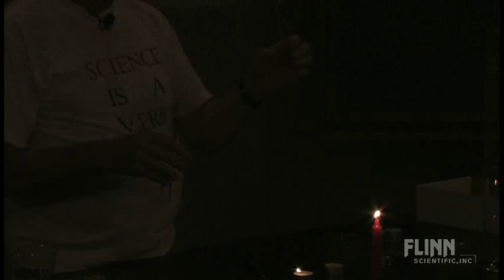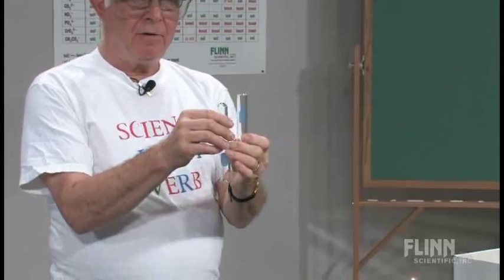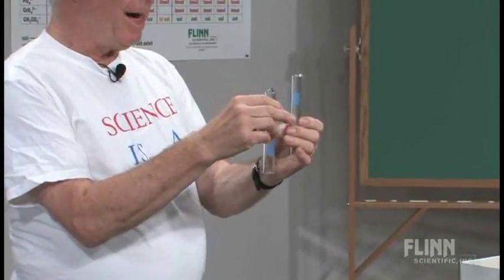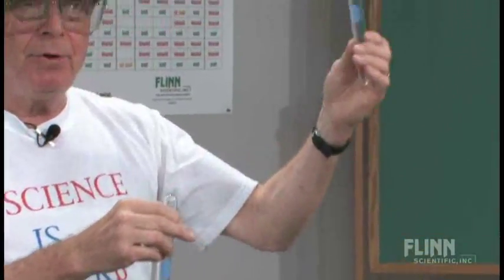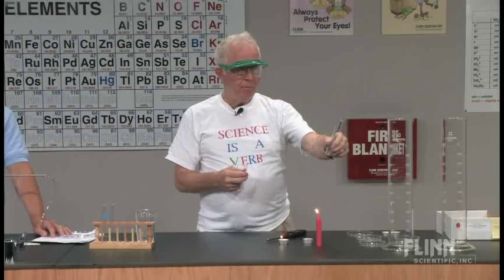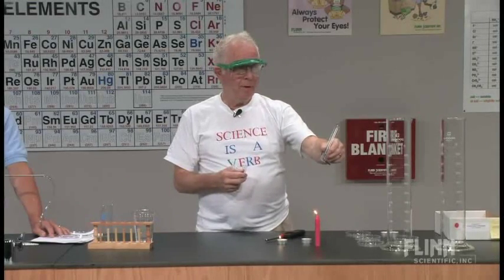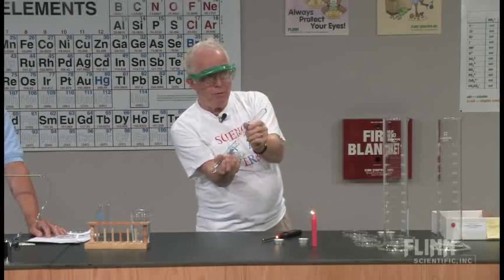Notice what I did. The tubes were like this, and I held this tube upright. I let hydrogen escape — or air come in — whichever you like. Both happened, so this was impure hydrogen. When we did it the first time it was pure hydrogen and it burnt slowly. The flame was still burning in this tube and you could see the flame jump from one tube to the other.